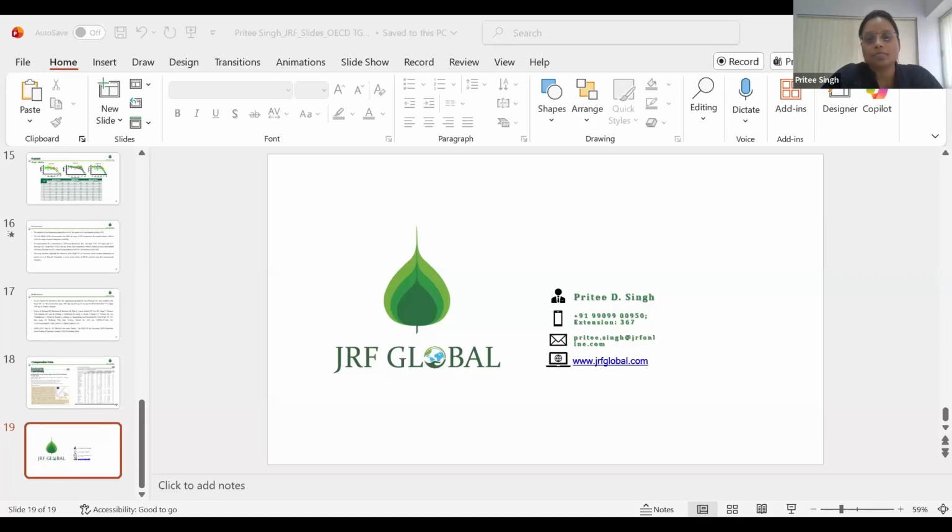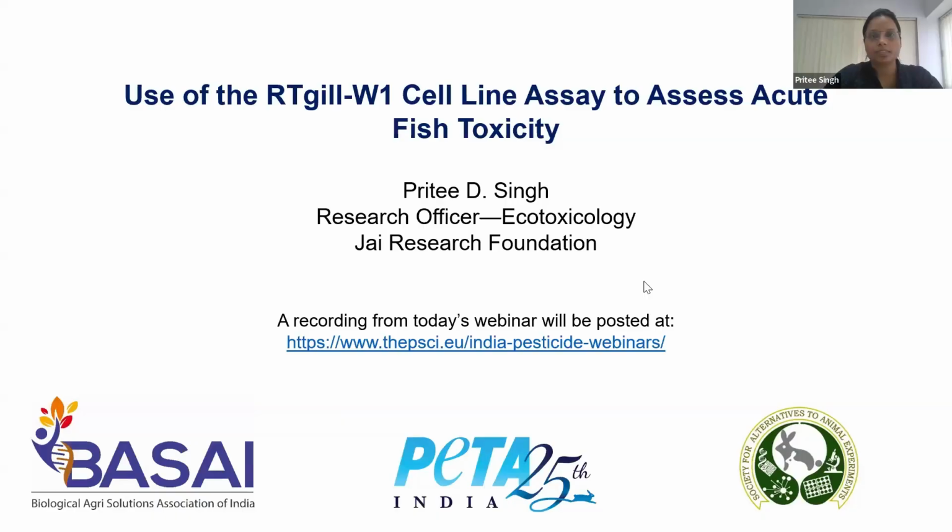And the data which we obtain from 249 can be utilized if we want to only check the preliminary screening or collect data for environmental risk assessment. This will be helpful.